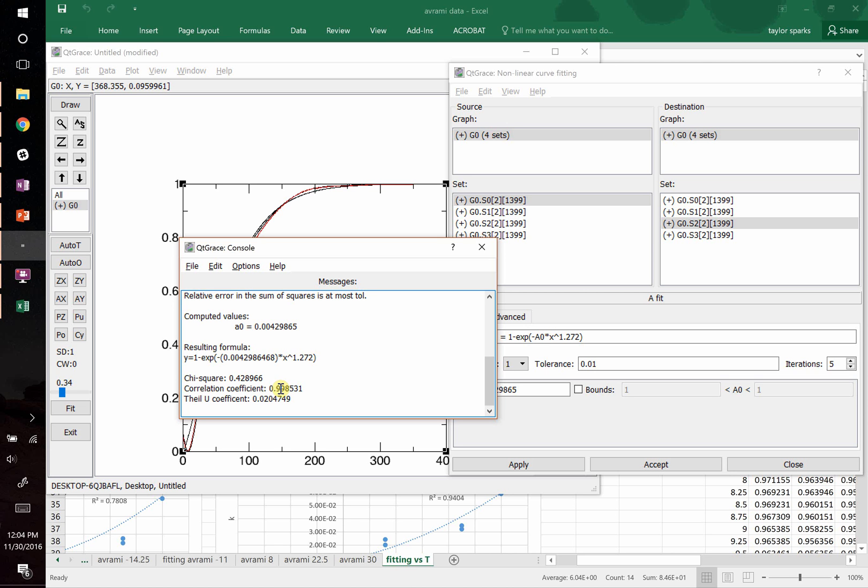So let's just take our data as it is and do it now. Do it. But what I'll do is I'll go in and I'll just start it at the minimum. Or if it, on the other curves, if it goes down, as soon as it reaches that minimum, if it starts to go back up, same, stop it. Yeah. So I can go through and do that. And then, I mean, I think this is good for the video as far as fitting the curves.